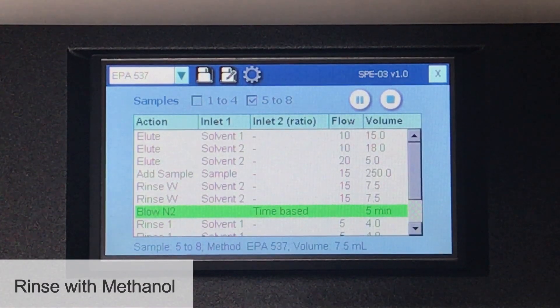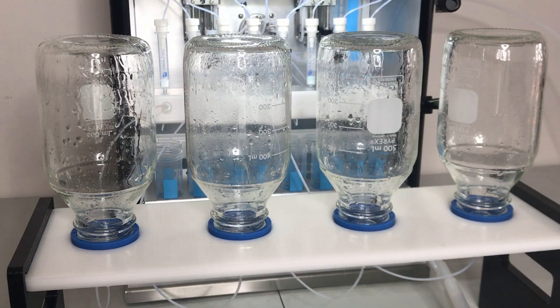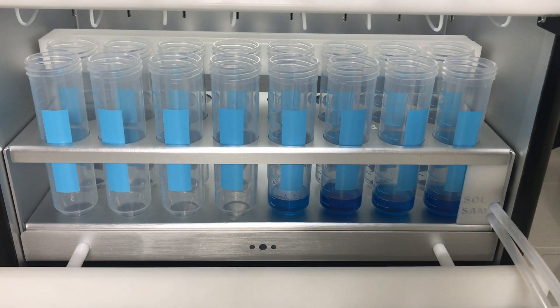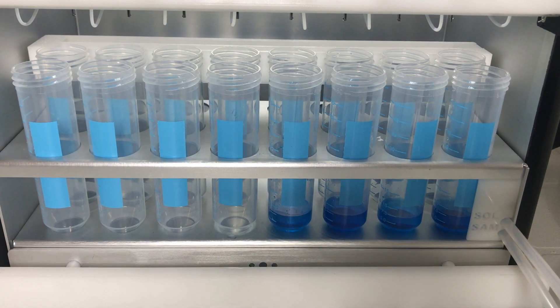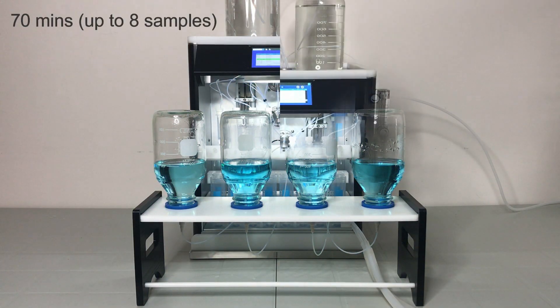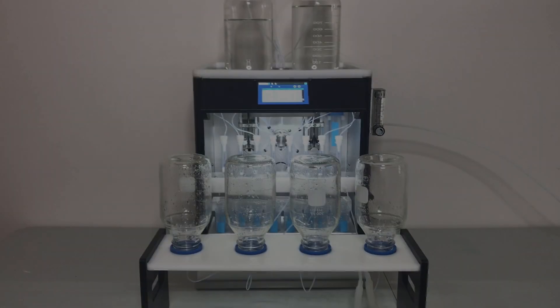After drying, the SPE03 rinses the sample bottles with two aliquots of 4 millilitre methanol, and elutes the SPE cartridges using the rinsate. The collected fractions are now ready for concentration. The extraction process shown here takes only 70 minutes for 8 samples, saving a significant amount of work during sample preparation for EPA method 537.